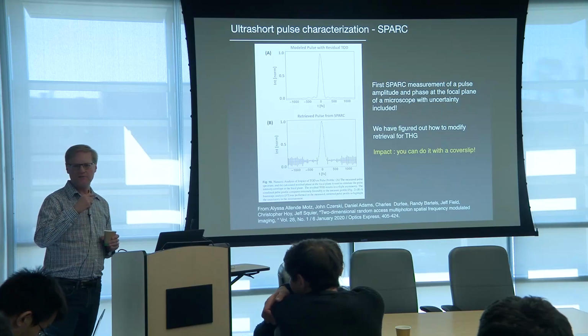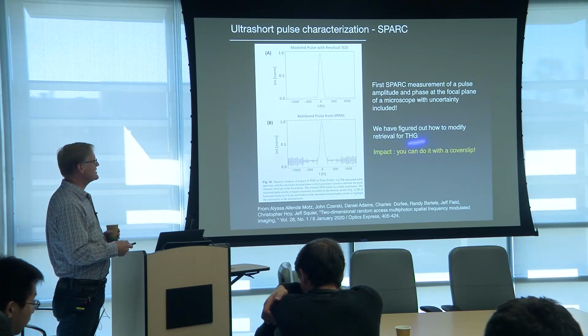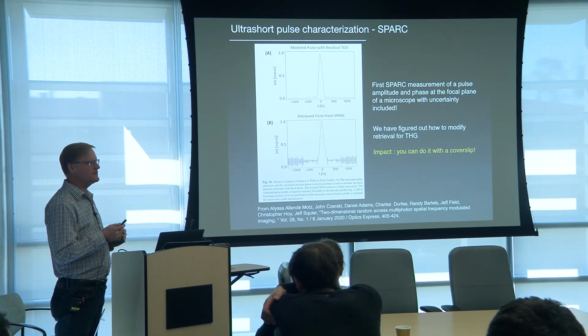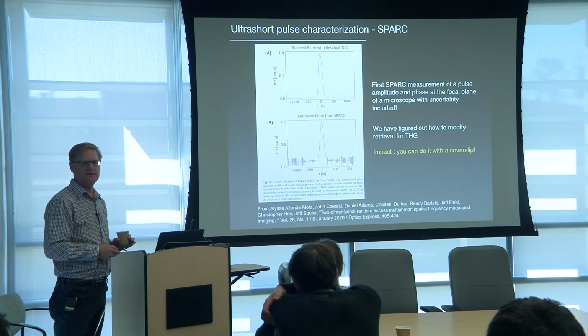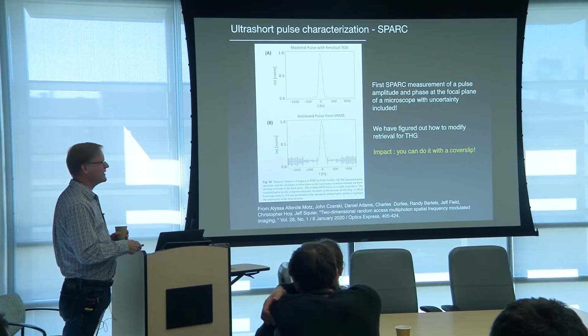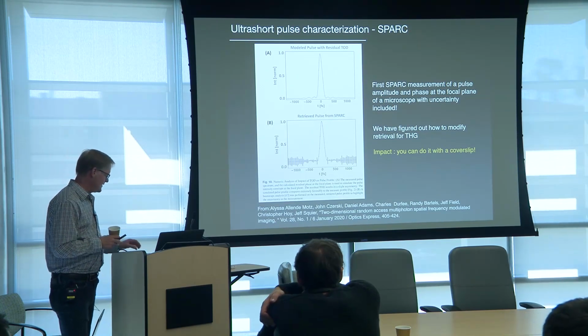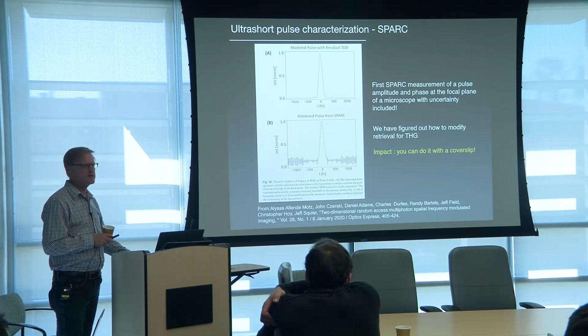Now we know how to modify our retrieval algorithm. So this is going to work with a cover slip as well. And so then you'll be able to do these spark traces with a cover slip in your system as well. So then it's going to be very far-ranging in terms of just the tunability of the lasers, etc.